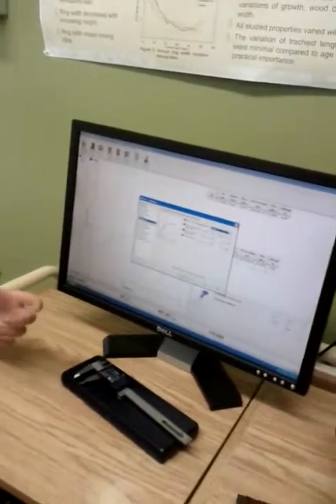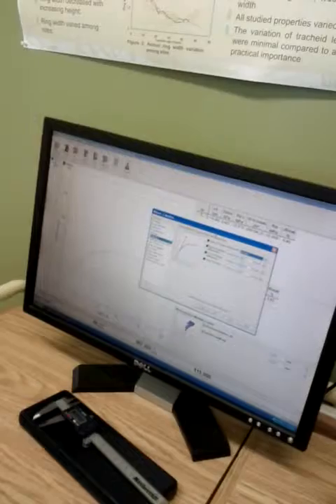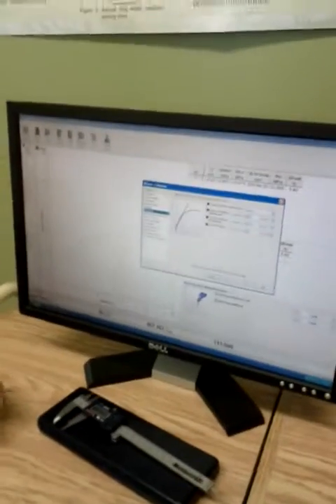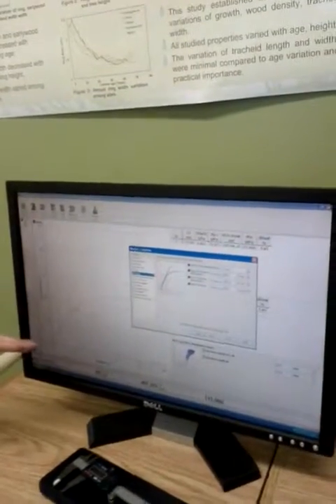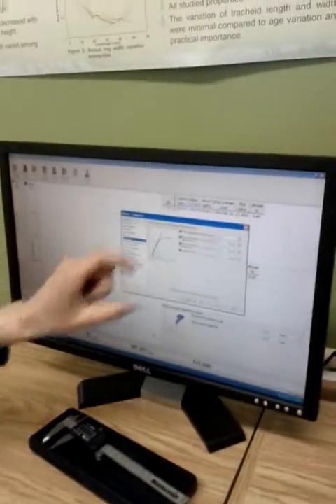Then I have to choose the beginning and the end point in the linear zone. For this case, I'm at 7. It's fine, and 18, I'm no longer in the linear zone. There's one value for the whole set, so after I've done all my curves, I choose a zone that works for everybody.